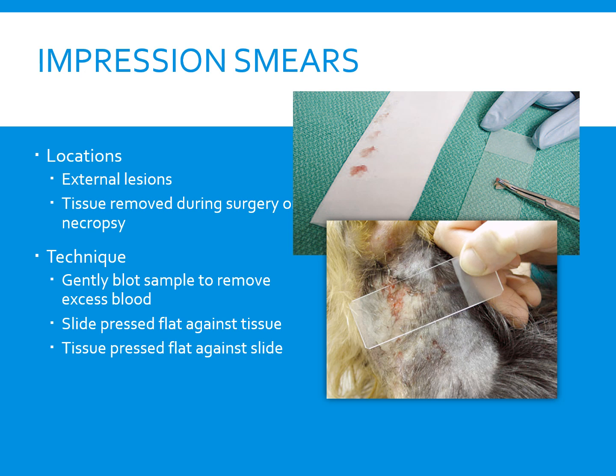In addition, excessive fluid inhibits cells from spreading and assuming the size and shape that they usually have on air-dried smears. If a delay occurs from the time of sample collection until the imprint is taken, a scalpel blade should be used to expose a fresh surface before blotting and sampling the surface.